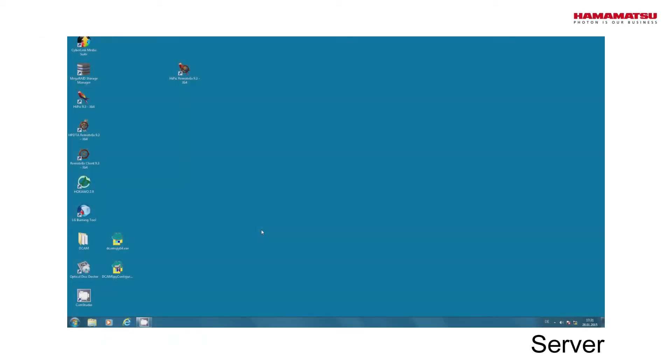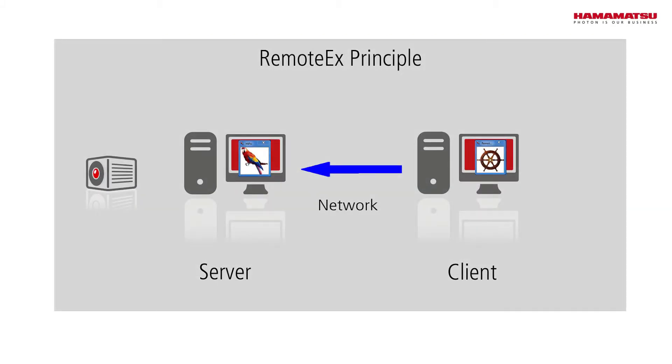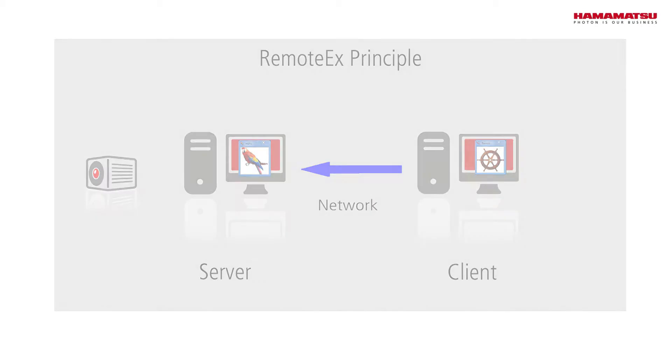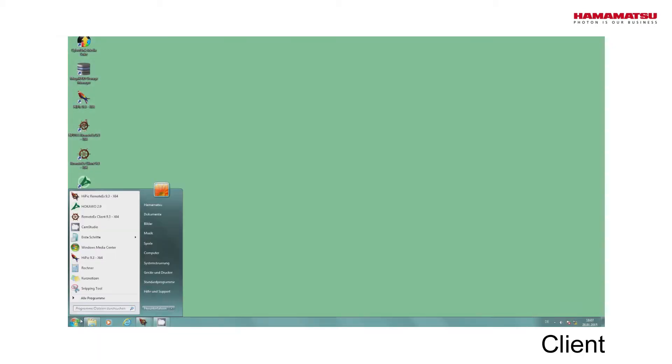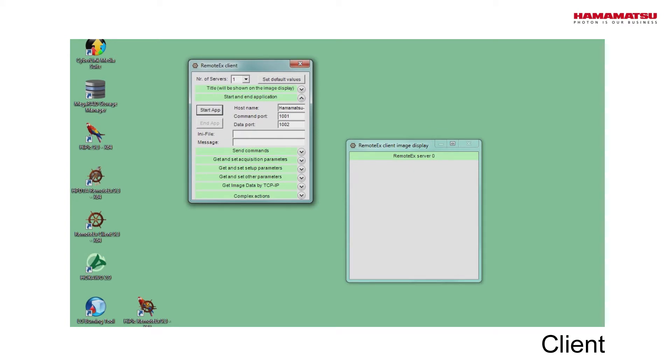To turn a computer into a RemoteEx server, it is sufficient to just start a RemoteEx program. A client program can now access the application from another computer through the network. For demonstration, we use the client program provided with the HiPIC, but customers can also program their own client program using the documented RemoteEx language.